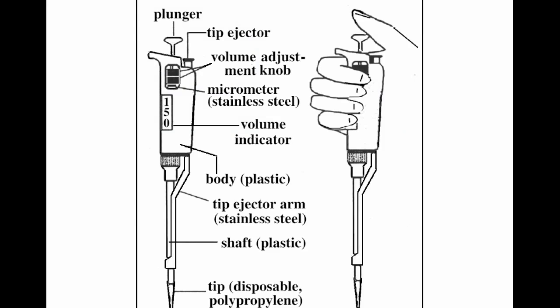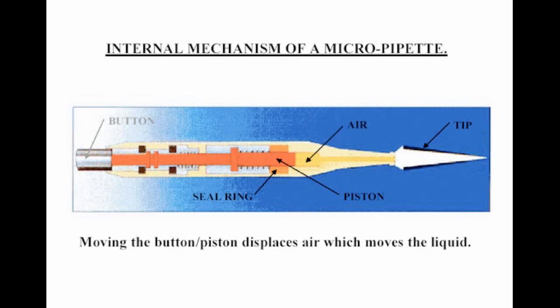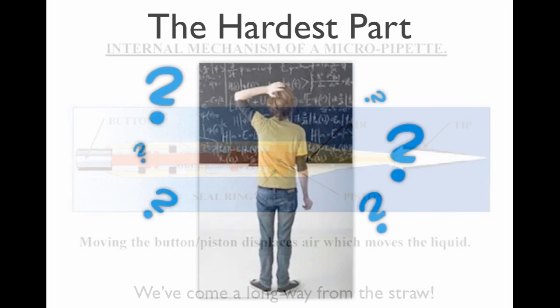There's a variety of companies that make them and all the different tips depending upon the size of the micropipetter that you're using. These are the parts of the beast. This is actually a fairly expensive piece of equipment. So please take some time and practice with it. I always have my students practice with water until they get the feel of it because it is an acquired skill. You can see the different parts and how you hold it in your hand. And at the very bottom, we have the disposable tip. That's this part down here. And this is the only part that will actually come in contact with your sample. It really is a fairly sophisticated mechanism for doing the same thing as a straw. But basically what you're doing is displacing air which moves liquid very much like a straw, but of course, with a very high degree of accuracy.